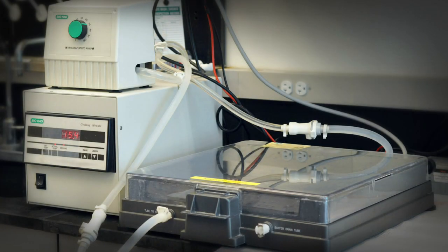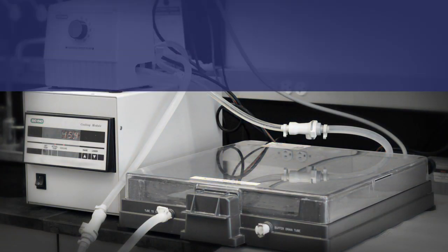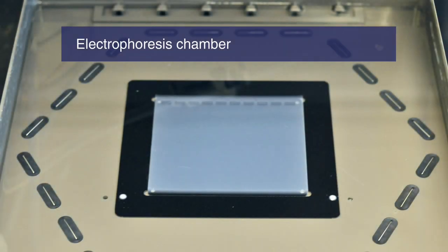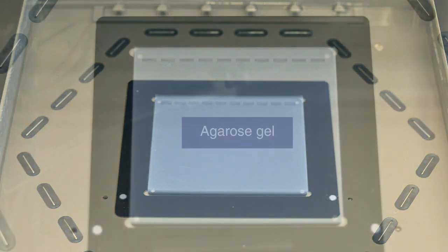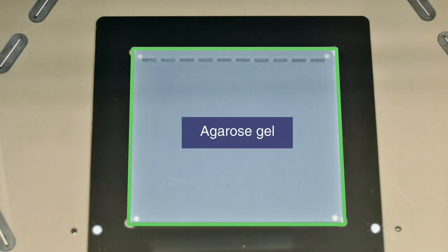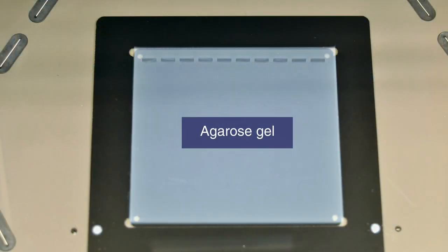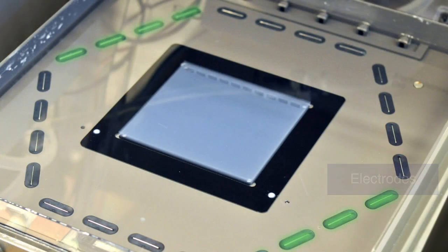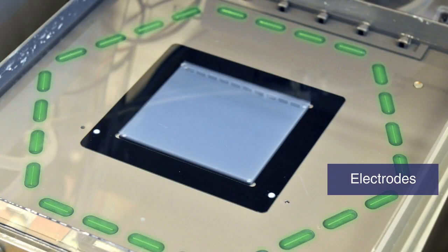Let's take a closer look at the equipment and conditions that will lead to successful PFGE. Here is the electrophoresis chamber, which contains the running buffer. The agarose gel should be well anchored in the middle of the chamber so that it doesn't float around. There are multiple pairs of electrodes around the gel, set in a hexagonal grid.